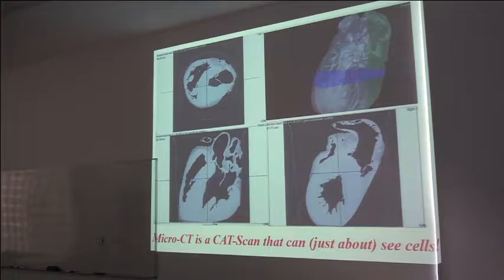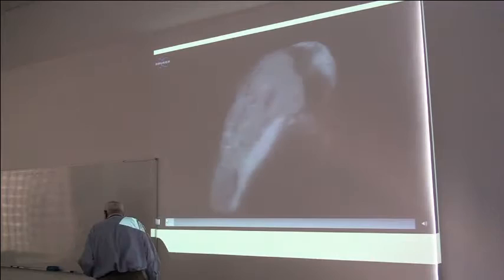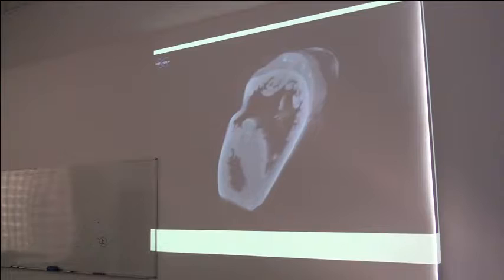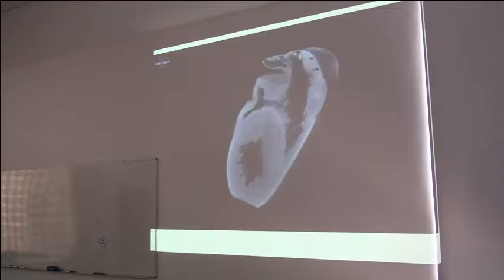Here's a human heart from the autopsy service. And it's great to study the fluid dynamics of a heart, but you have to know what's the shape of a heart. So, this was a heart from a young man who passed away from another cause, was sent in for an autopsy. And here, the beautiful thing about a human heart, if you have a micro CT image, is you can dissect it, and then the electronics lets you put it back together again, so we're cutting it from the side. Now we put it back together again, let's cut it down from the top.